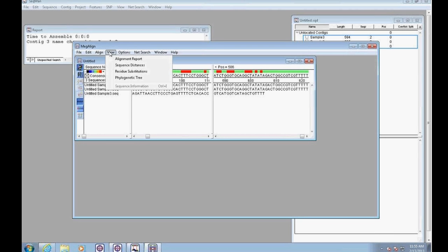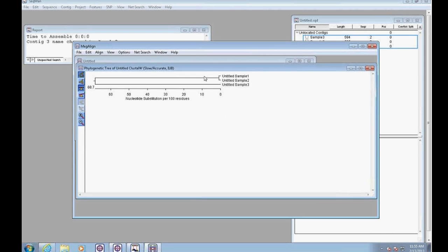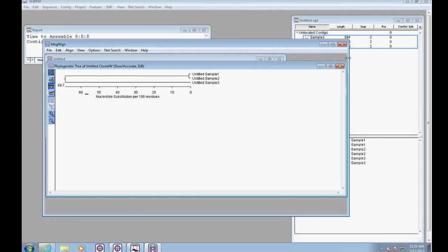And we'll quickly do the alignment. And now you can see the phylogenetic tree by going to View, Phylogenetic Tree. And here you can see our contigs that are very closely related. You can see a score, and we have a scale at the bottom of this window. And that was a very quick overview of assembling multiple sequences into groups. Many customers use a 96-well plate to do these types of sample assemblies, but you can also use it for other data types and experiments.